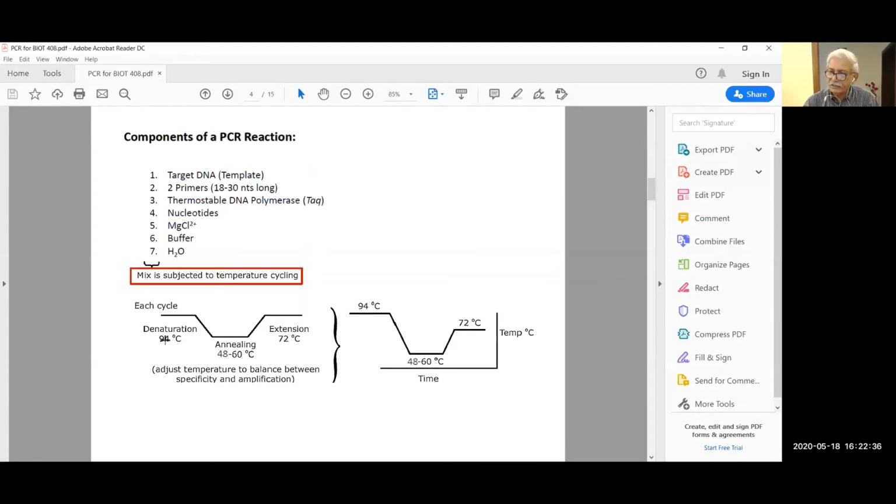You can set the PCR machine to 3 different parts of the cycle. These parts are denaturation, annealing, and extension. All these temperatures are different. First is 94. It is always 94. If you are using Taq polymerase, it is always 72. If you're using Pfu, it is always 68. Okay. So remember, these temperatures are constant.